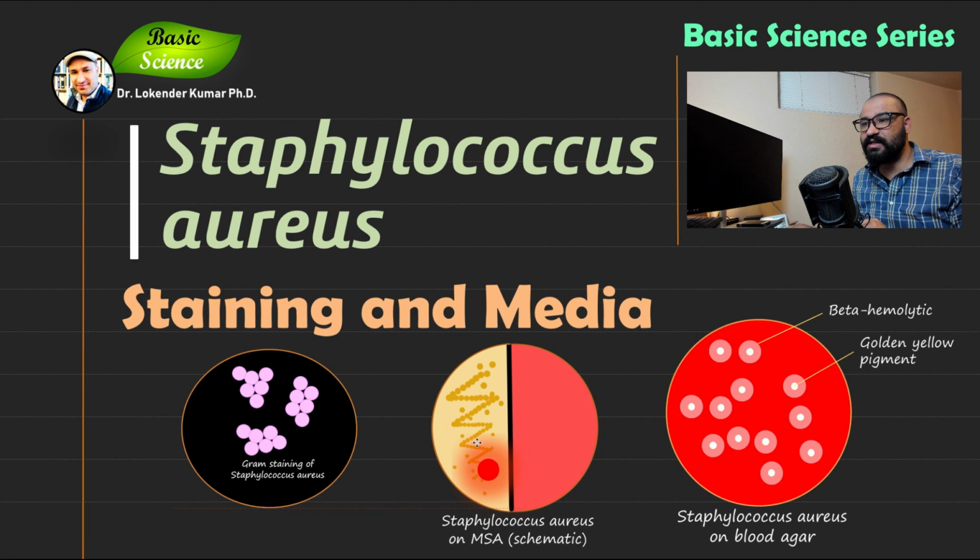And also you can see it's going to produce colonies, and it's going to change the color of the mannitol salt agar if you have Staphylococcus aureus. And in the blood agar, you will see a clear zone of hemolysis, which is beta hemolysis, and you can say Staphylococcus aureus is beta-hemolytic in nature.